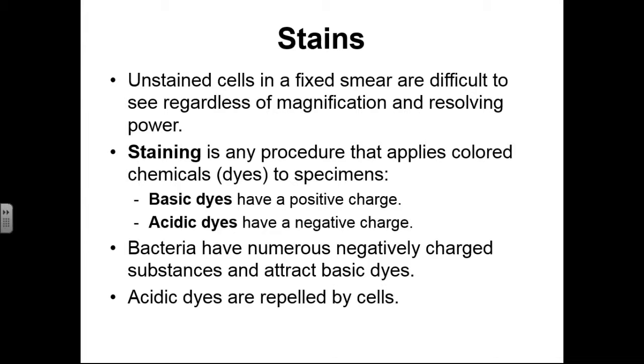So if we use a basic dye with a bacterium, generally speaking, a basic dye sticks really well to the bacterium. But let's say you want to see the overall shape of the bacteria. You don't want to see structures in the bacteria, but you want to color the background. If you want to color the background, you should use an acidic dye, because the negative charge of the acidic dye is going to be repelled from the negatively charged bacteria.